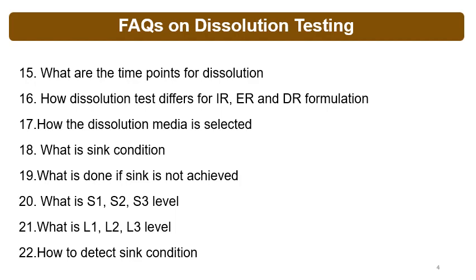How the dissolution media is selected? So dissolution media is selected based on the API solubility, formulation characteristics, API stability in the media, and the sink conditions.